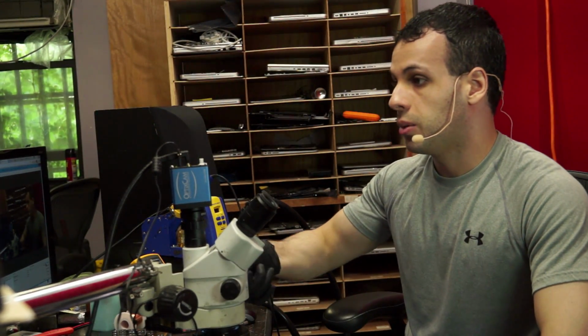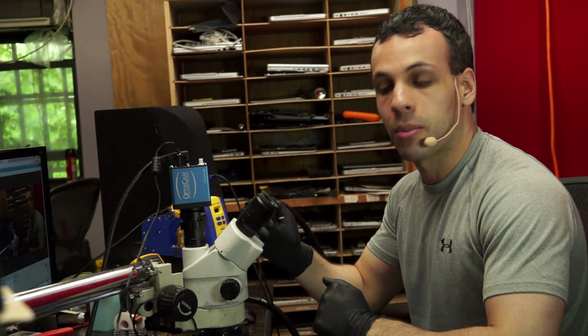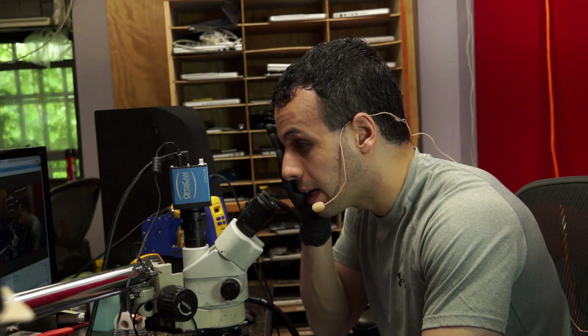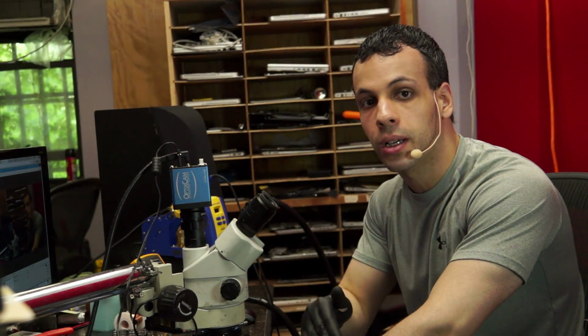Now, with one of the crappier microscopes, the issue is that you can't see through both eyepieces when using the camera. So if I want to use the camera, I have to pull something, and when I pull that, I now can only see out of my left eye. That just sucks. Working with one eye sucks. I don't want to go back to being a Cyclops. I'm spoiled. So I'm linking you to a microscope that is simulfocal. That's a very important feature to me.